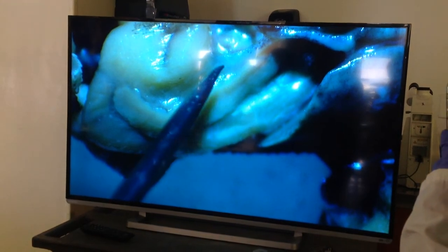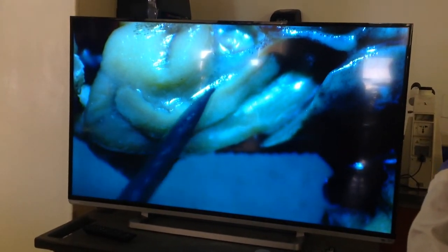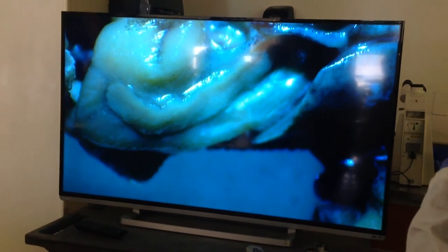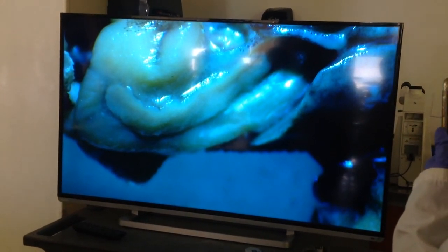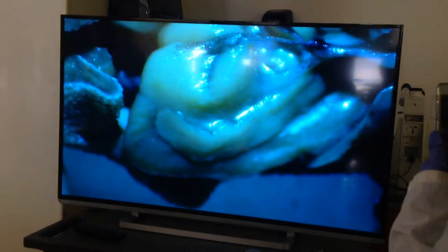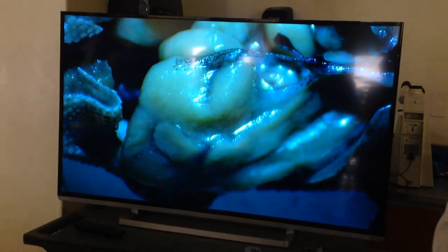And that right there will be the pancreas. The pancreas is pretty big in these guys — you can see it quite clearly. You can see it a little bit better now. Pancreas.